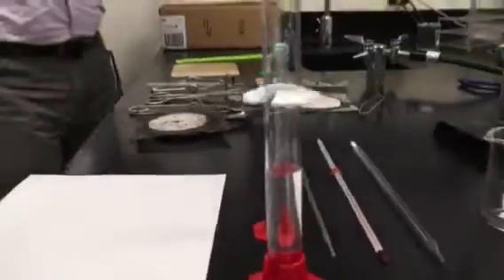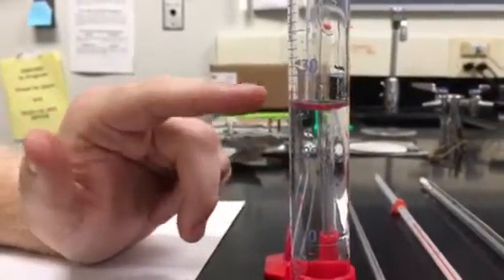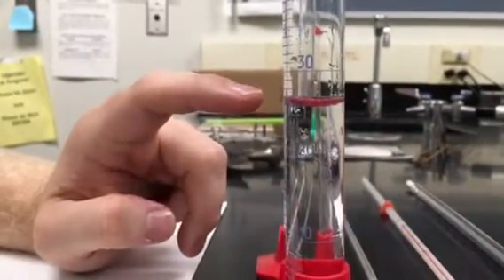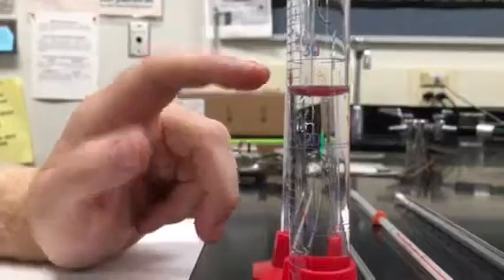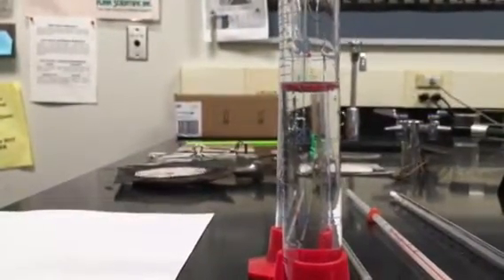If you aim the camera there, you can see that we have lines for 20 and 30, and then technically 9 lines between them, one for each milliliter. So basically this measures to the nearest milliliter. What you need to do is estimate one extra digit beyond that. If I look at the bottom of my meniscus, I'm seeing it maybe just above the 26 line, so I might call that about 26.1. But if I judge it to be right on that line, you really should add that 0, 26.0.